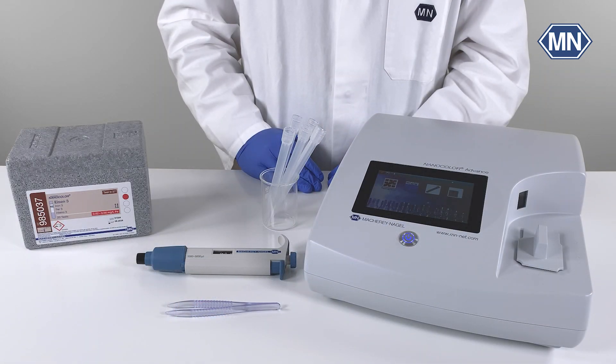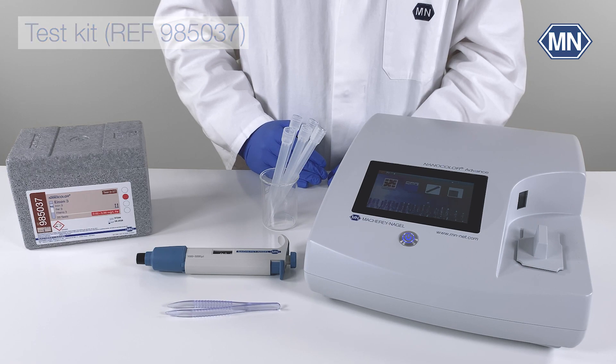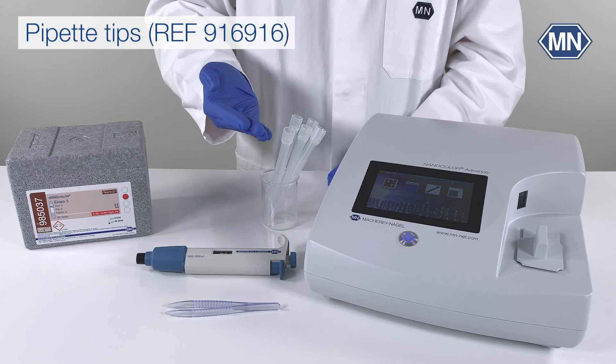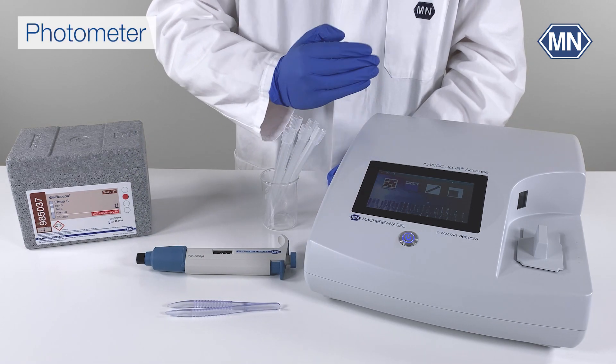To perform the Nanocolor Iron 3 test, the following materials are required: the test kit itself, which is sufficient for 20 determinations, a 1 to 5 milliliter piston pipette, suitable pipette tips, tweezers, and a photometer — in our case the Nanocolor Advance.